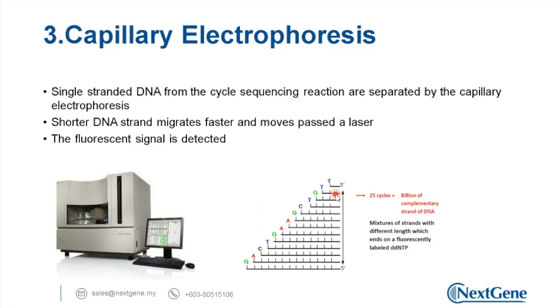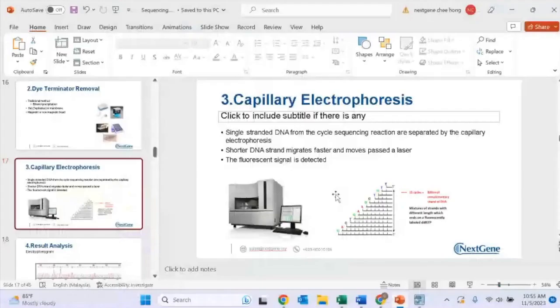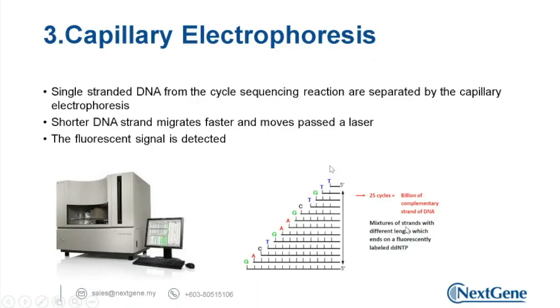All right. And we have another question from Min Lim. Hi, how to increase the concentration of the gel extraction? What is the suitable concentration of gel extraction to send for sequencing? Okay, thank you for your question.